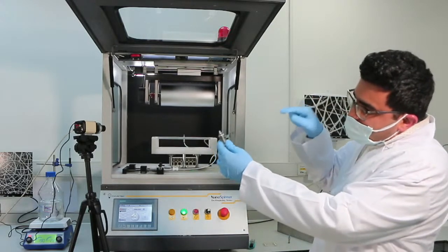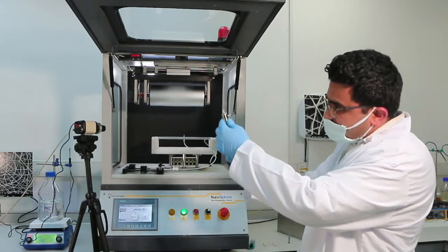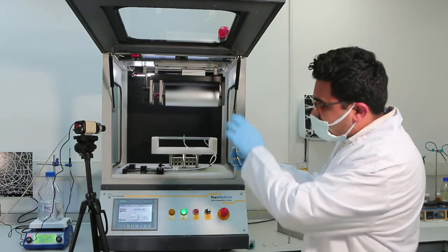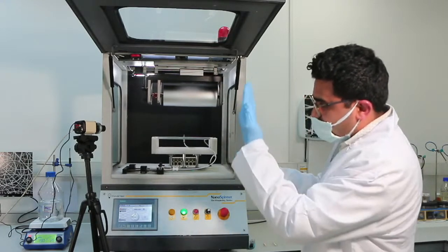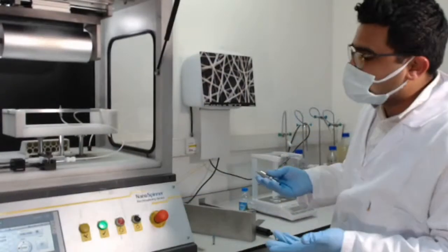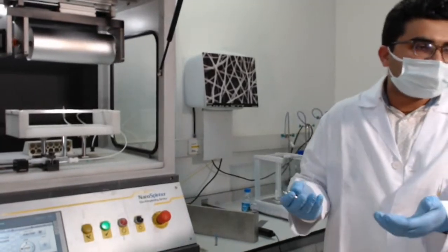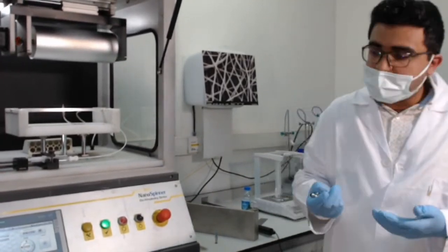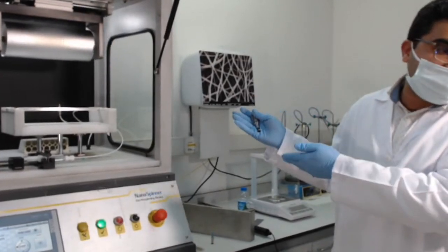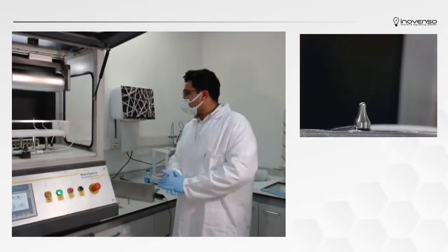You can feed gas into one nozzle and the solution from up here. While it's spinning, the gas will help push it upwards, help its trajectory, so to speak, and that way there will be better spinning. This is for those sensitive polymers that you have problems with, like hyaluronic acid.